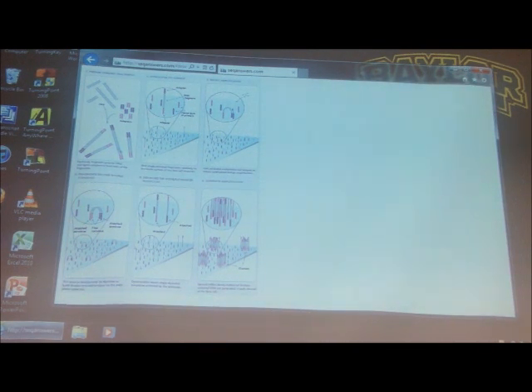Once again, we're going to have pieces of DNA, and we're going to attach adapters to them, just as we did with the 454 sequencing. But then we have a whole field of little oligonucleotides, a giant field of oligonucleotides stuck to a plate. And then we let the adapters bind to these oligonucleotides. And then we do a PCR to amplify all these oligonucleotides.